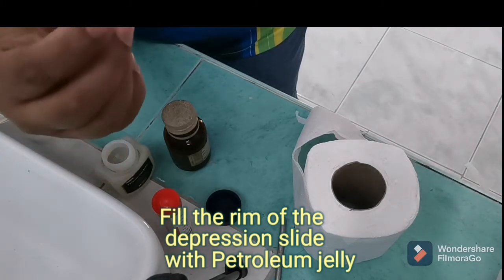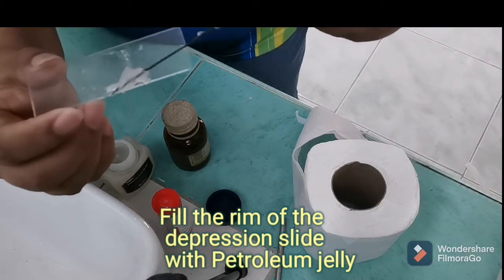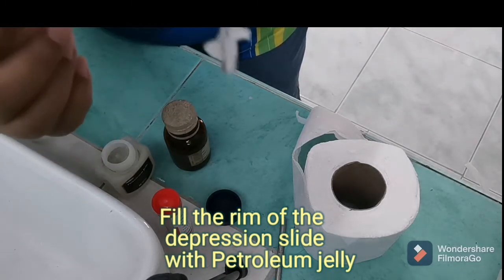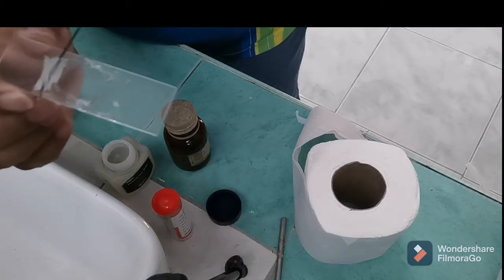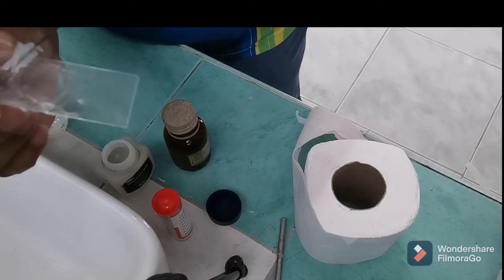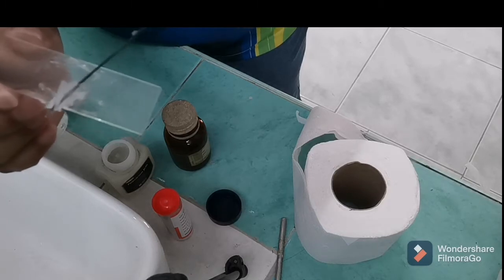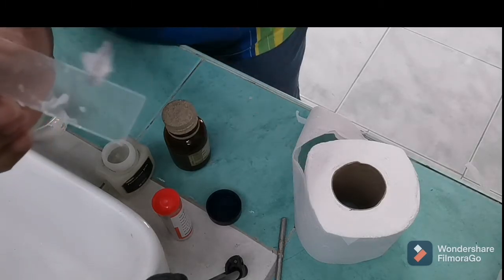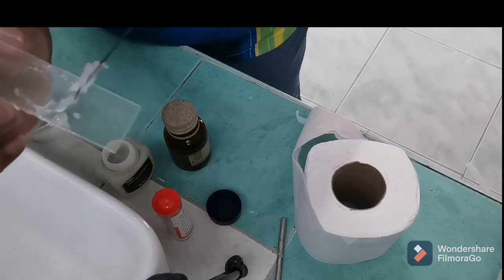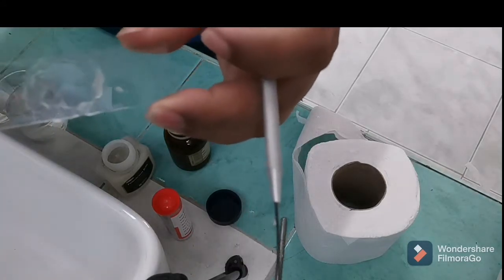Sometimes you can develop your own technique in placing petroleum jelly. You can add some more if you want, especially if you will be using a larger amount of liquid to be observed, or you have an unknown microorganism that requires an area to allow the microorganism to grow. So that's it.